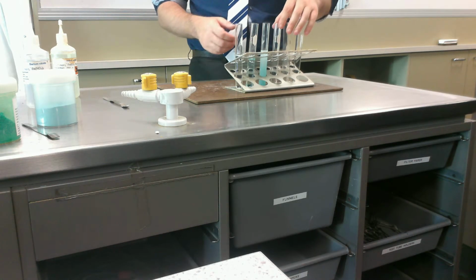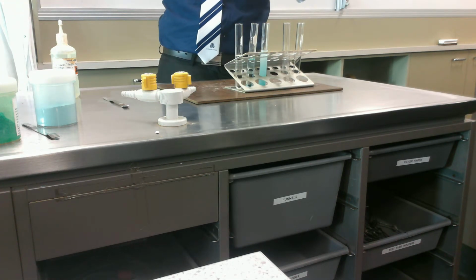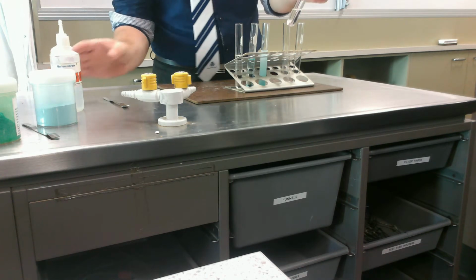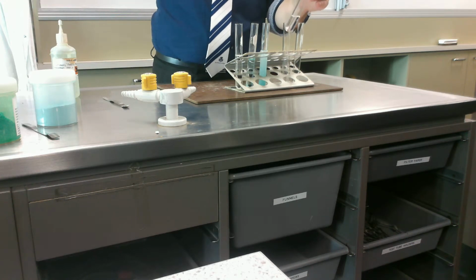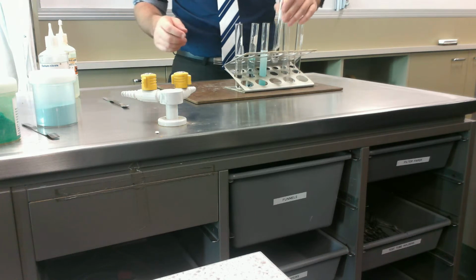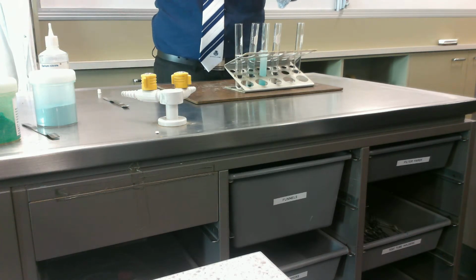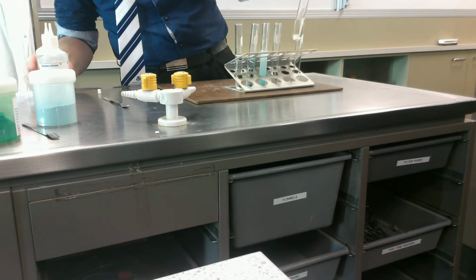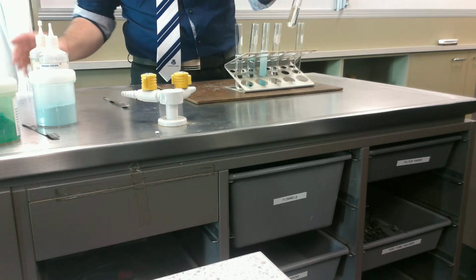The last thing I want to show you is what happens if I mix two solutions together. So I've got barium nitrate, which I would describe as a what colour? Colourless. Well done, a colourless solution. So this is made by putting barium nitrate crystals into water. I'm going to have some iron sulfate solution, which is a very pale yellow solution. So it's made by putting iron sulfate crystals into water and they dissolved.